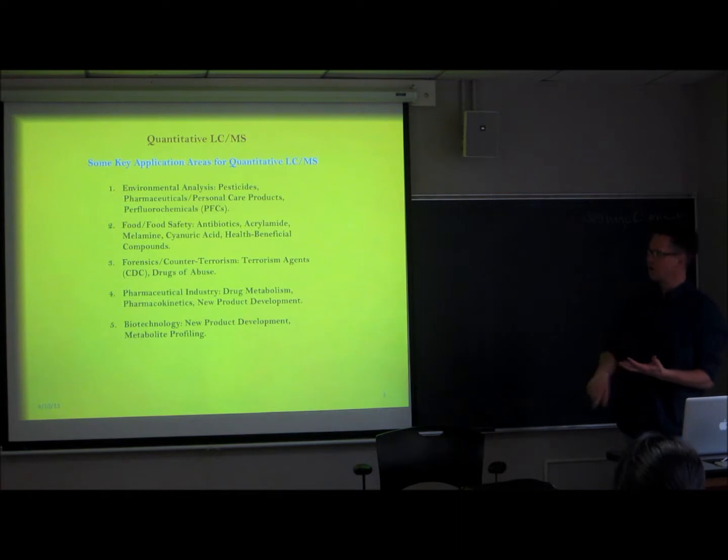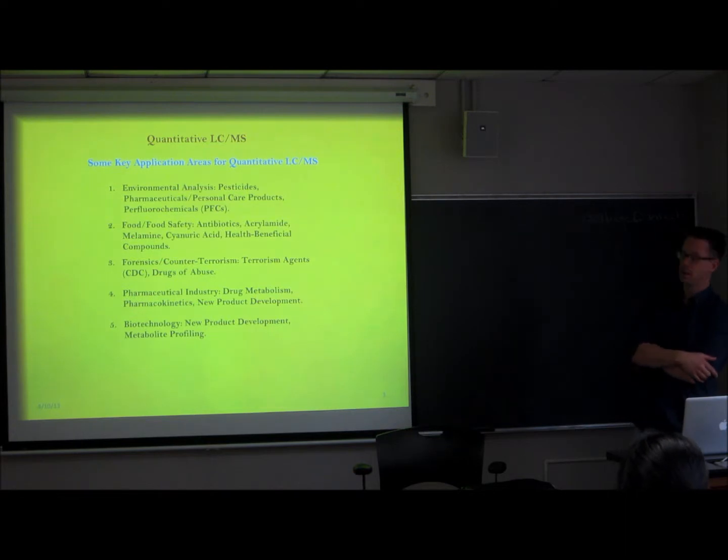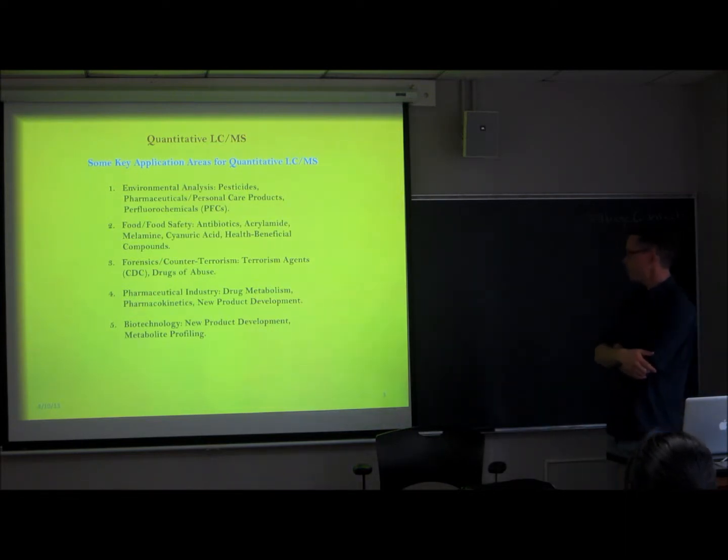You've got protein, you've got carbohydrate, you've got all of these different chemical moieties that really interfere with analyses, and having the specificity of mass spec to go in and pull things like this out of those complex mixtures and be able to say, are they there or aren't they, and how much is there, becomes very important.